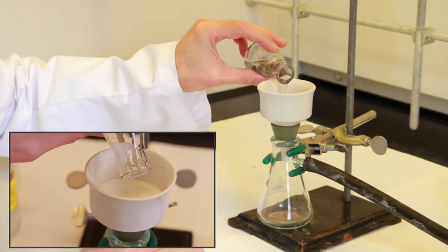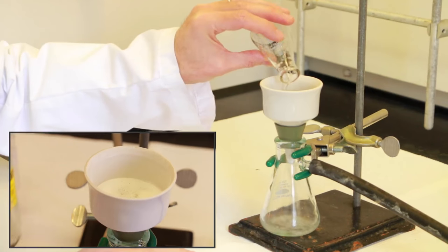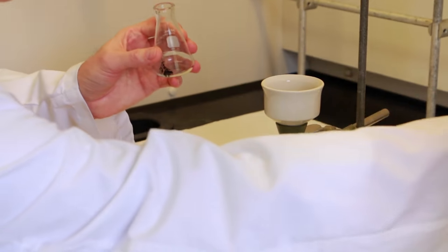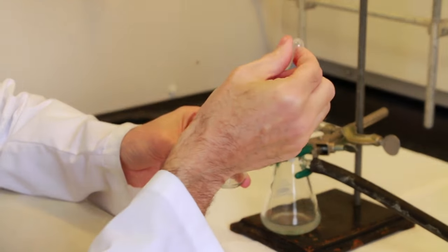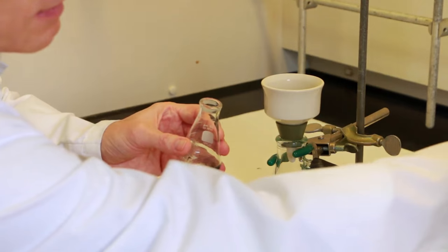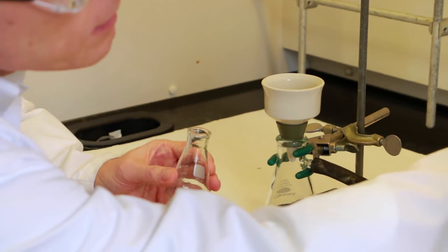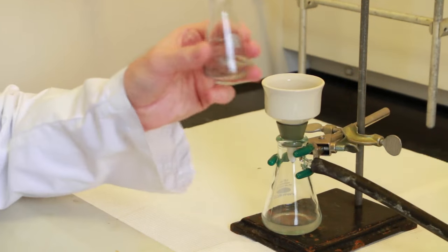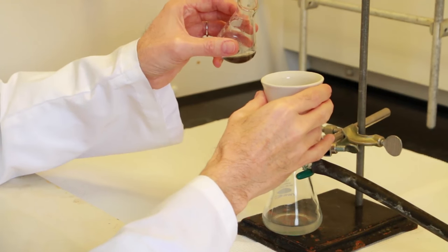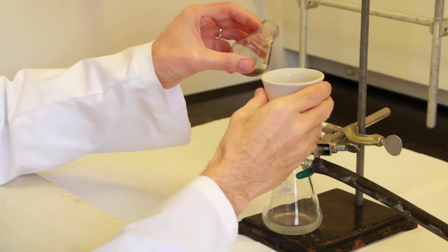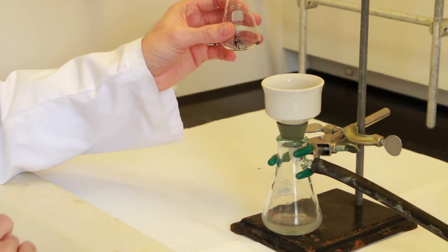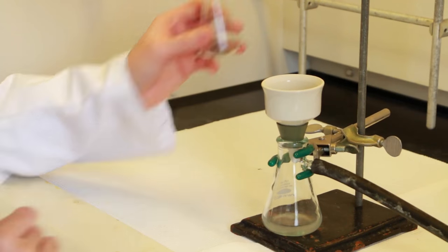Then you can filter as usual. You may want to rinse your flask with some of the solvent and rinse the celite as well to make sure that none of the product is trapped in the celite bed. Then you add that solvent to your solution.